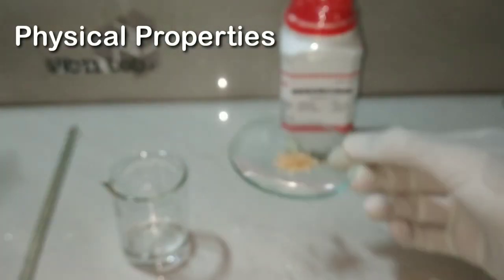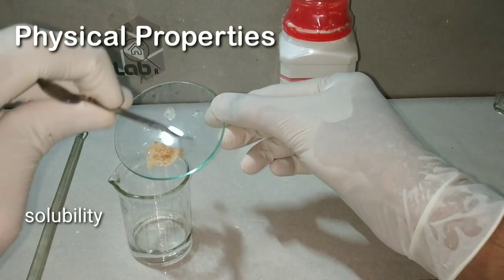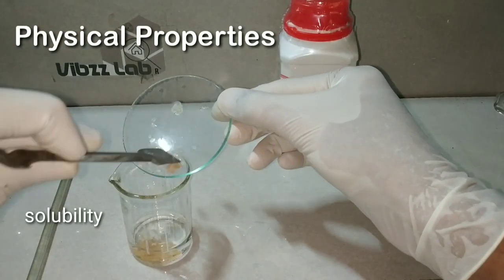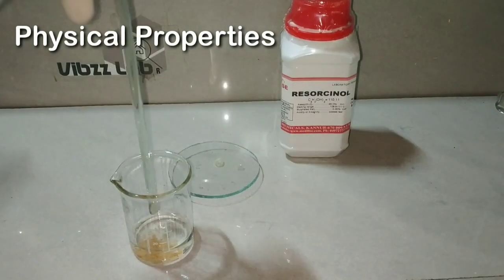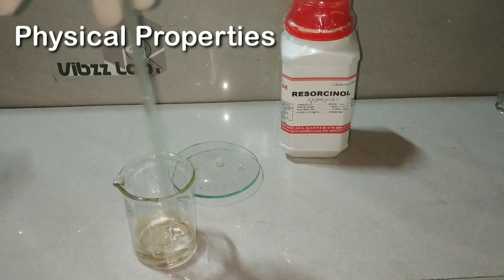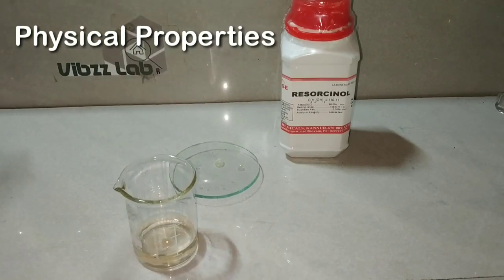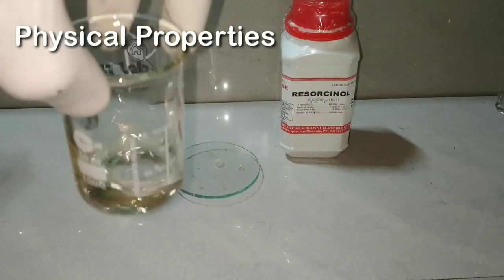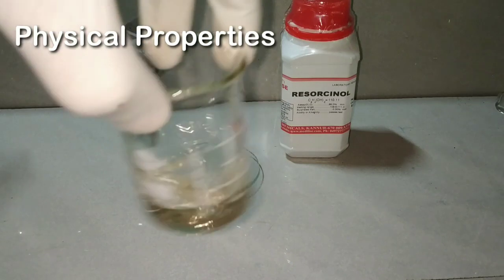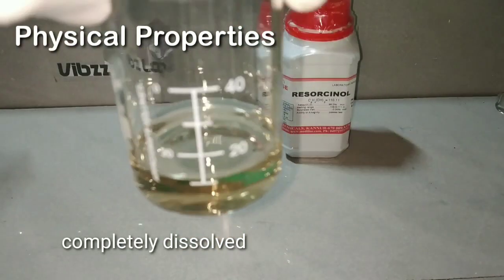First of all, about the appearance, you can see that it is crystalline in nature. The next test is the solubility. Here I have taken approximately 20 milliliters of water in the beaker and I am dissolving the resorcinol in it. You can see that on mixing it well, the resorcinol has dissolved in water and the solution has turned clear.